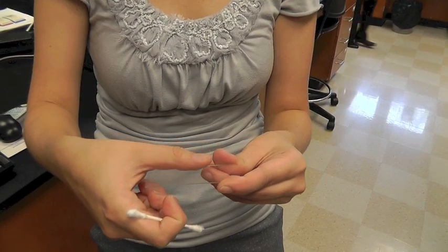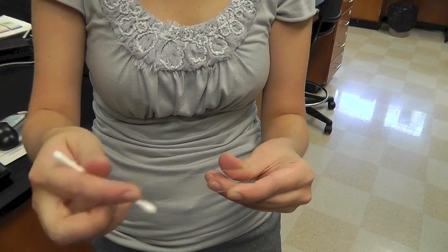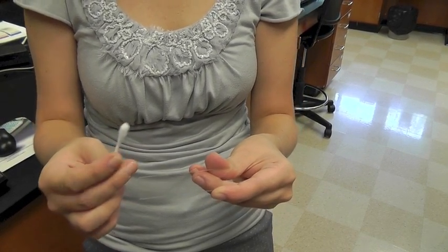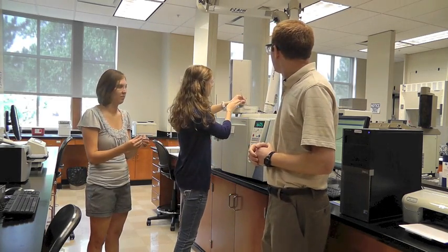Morgan is going to take her fingerprint on a slide and then with a Q-tip, after dipping it in a liquid, she'll take up all the oils from the print and then we'll dissolve it in liquid, prepare the sample, and then Rebecca will inject the sample into our instrument.